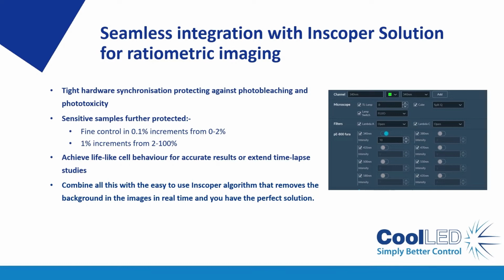Combine all this with the easy-to-use INSCOPER algorithm that removes the background in the images in real time, and you have the perfect solution, which you will see demonstrated.